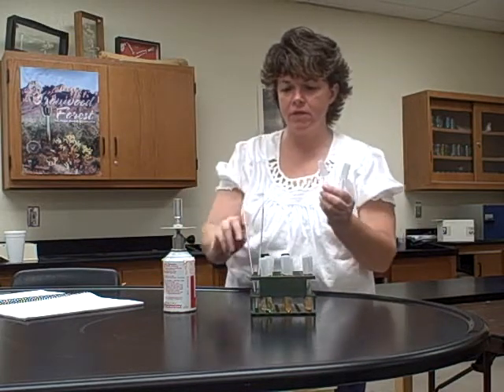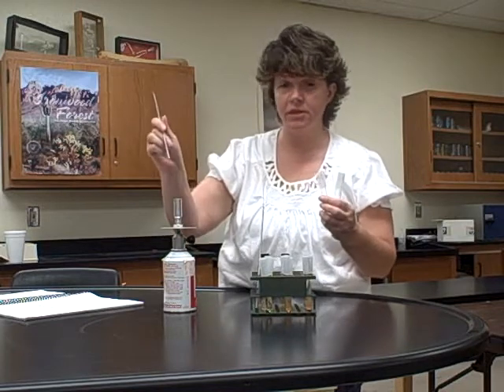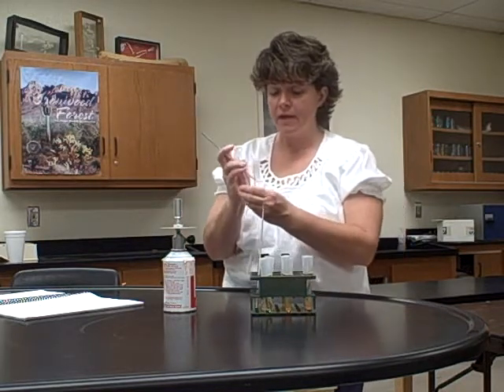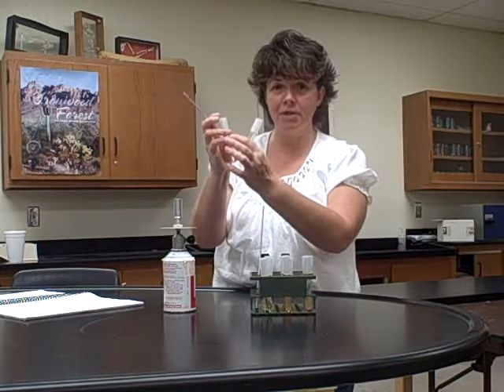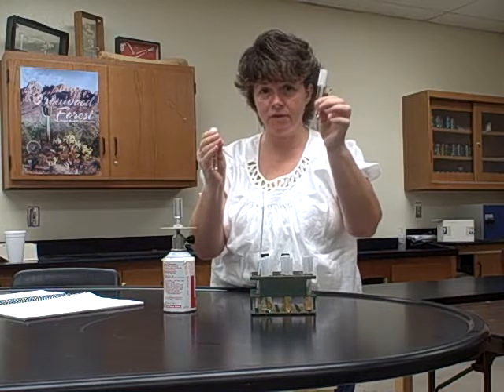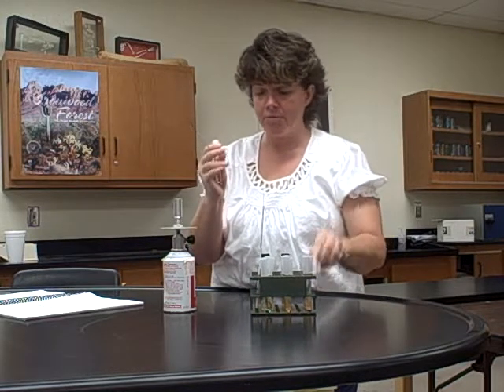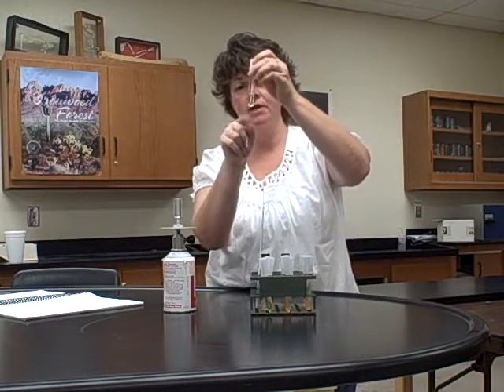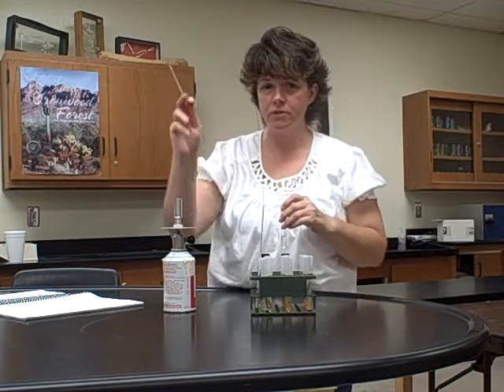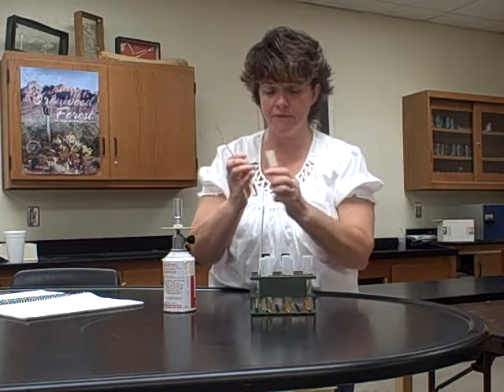Now, the first thing that you want to do, of course, is to sterilize your loop, okay? And then, of course, you're going to let it cool off. Now, this one would be the culture, and it would be labeled with the culture's name. That's what you're taking from. And this one would be the broth that I'm putting it into. Now, remember, if it falls to the bottom, you kind of want to do the tapping to bring it up, okay? So you're going to sterilize your loop, and then it's going to cool, like we've done before.